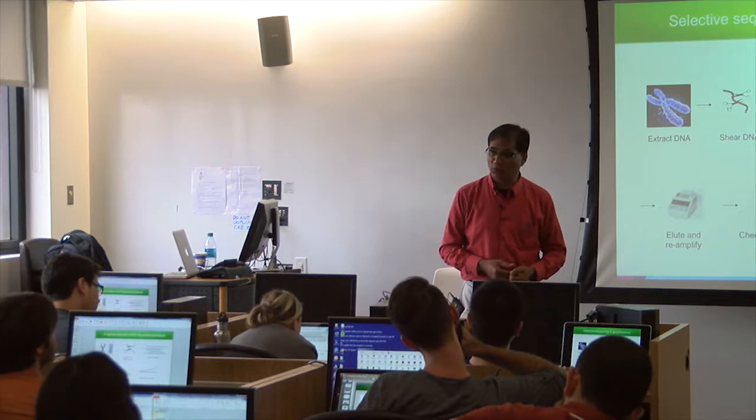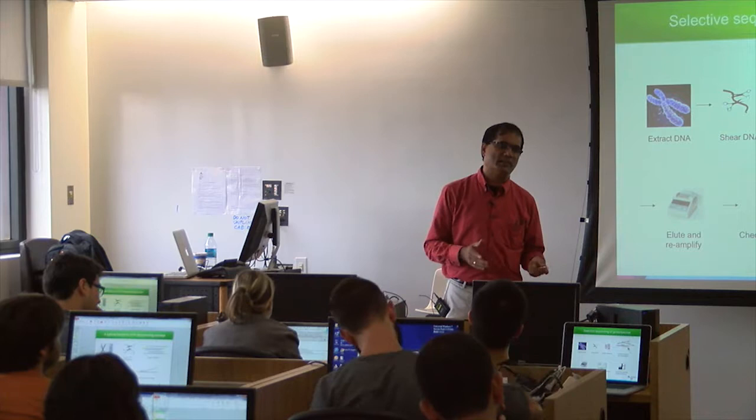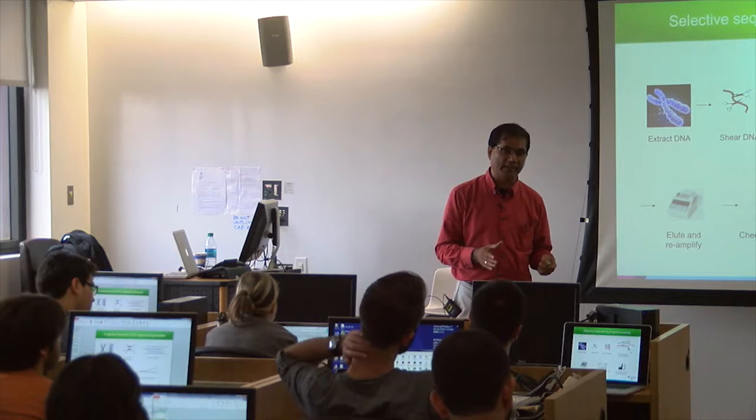Now some companies are coming up with enzymatic shearing. They say that you can use certain enzymes. You don't have to buy that machine. Use that enzyme, you get cuts. But again, there's a concern whether the cutting is random or whether there is a selection of sites during the cutting.